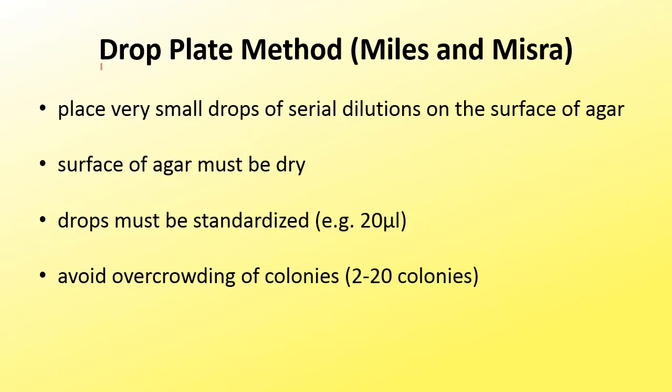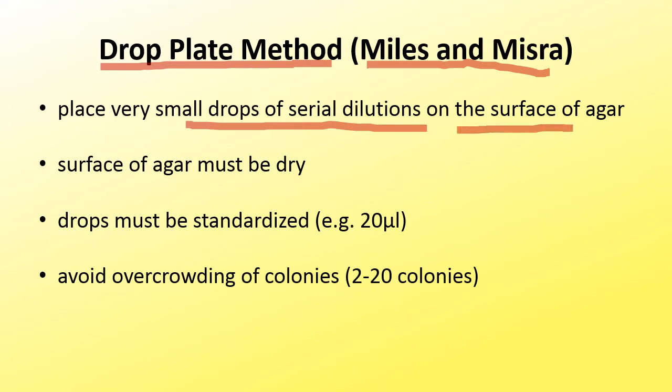Okay, the following method is the drop plate method, also known as Miles and Misra. This drop plate method is quite similar to spread plate, but instead of using a hockey stick, the serially diluted suspension will be dropped onto the surface of the agar.